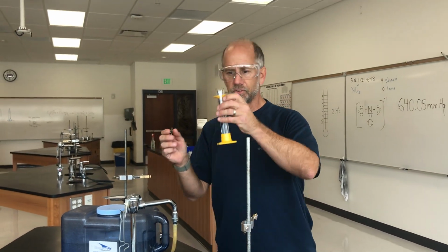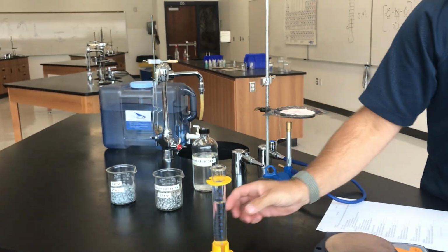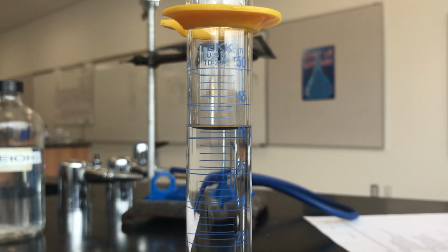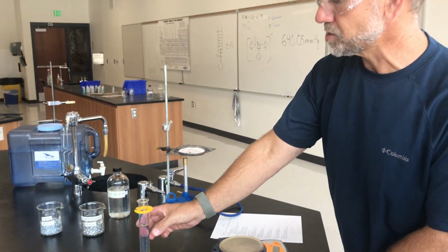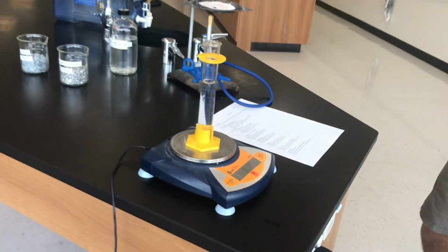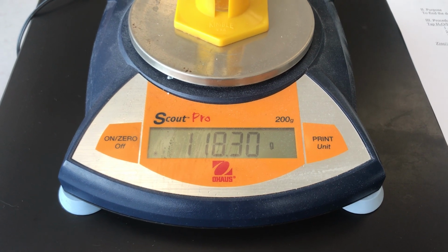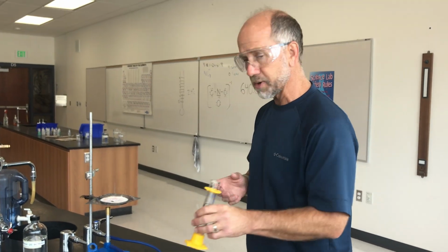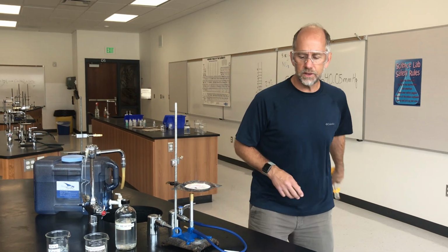and got a little more than the scale, so we'll stop there. Again, take a second and record the volume of that sample of distilled water. If you weren't able to do that, you can always back up and pause the video. And then finally, we will re-zero one more time, place the graduated cylinder on the balance. And we're now done with the second set of trials where we now have the information we need for distilled water. The last one we need to do then is the ethanol.